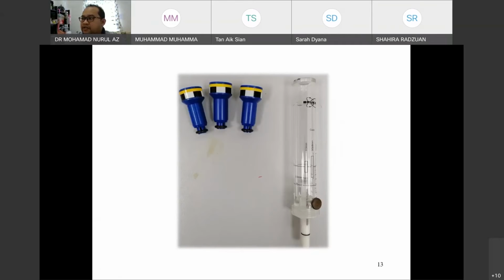So this is the gauge, or the sample adjuster. This is the spinner. For the Bruker types, we have the plastic spinner, but when you put the sample inside the ring, make sure it's not loose.